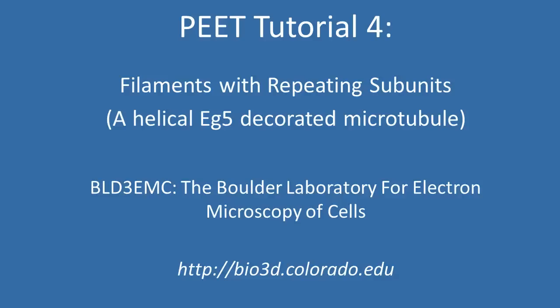Previous tutorials have all dealt with isolated particles. In this tutorial, we'll look at aligning and averaging subunits which repeat along a filament axis.